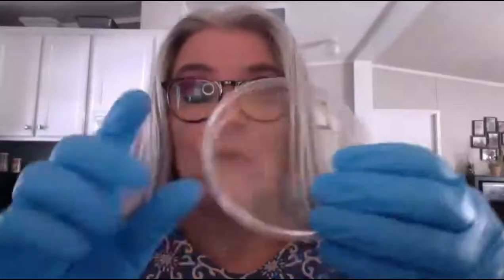And I also have a couple of plates to show you. Here's an agar dish that looks very similar to the one you saw in the video. The color of the agar in the bottom of this dish is a very light sort of beige color. So it almost looks like there's nothing in here. But we melt and pour the agar into this dish, and we can add whatever we want into the agar in terms of nutrients to feed the bacteria while they grow. Remember, we always keep these upside down because we want the condensation to be able to drip off of the agar and then down onto the lid so it doesn't interfere with the cells.